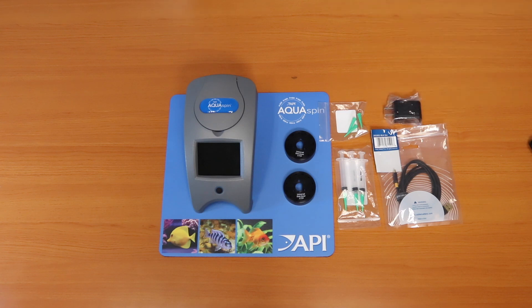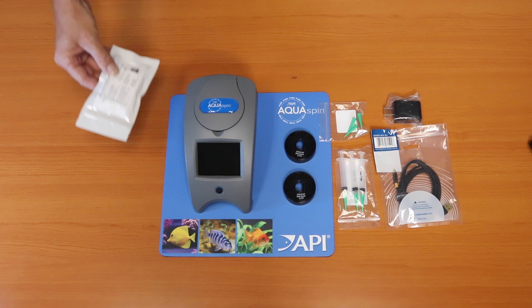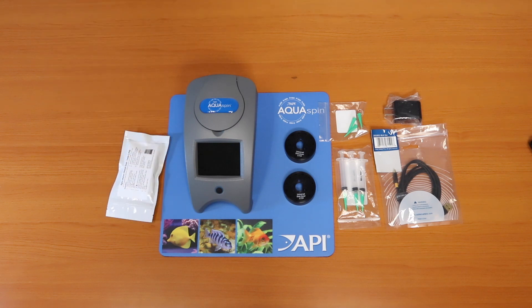You will have a charging plug. You will have a spin meter check disk, which will verify the performance of the meter. And you will find a polishing cloth, which is ideal to remove any smudges or fingerprints on the screen itself.